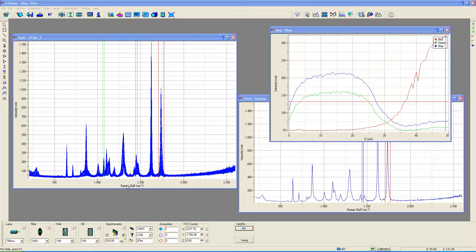Welcome to another edition of Hariba Raman Academy. This installment is titled Depth Profiling of Multilayer Polymer Films by Confocal Microraman Spectroscopy.